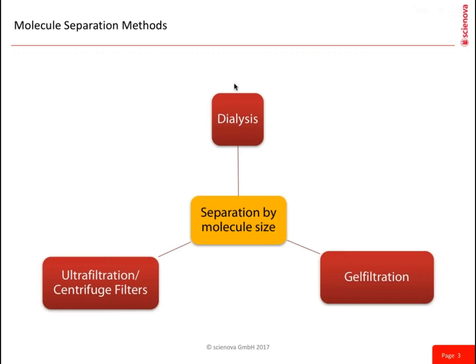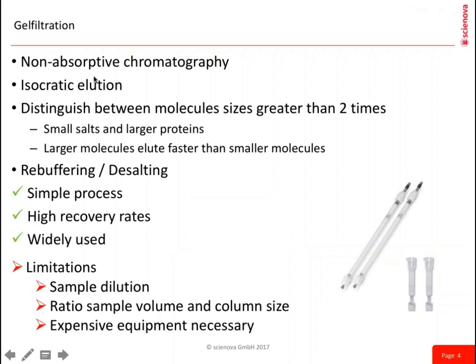There are three methods for the separation by molecule size. The first one is dialysis, which is the topic of this webinar, and there are ultrafiltration and gel filtration too. And I want to talk about the gel filtration first, and say something about this method. It's a non-adsorptive chromatography with an isocratic elution.